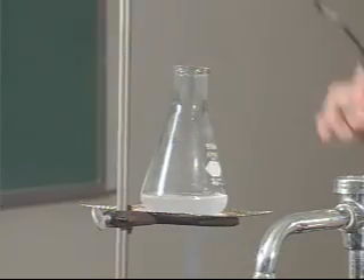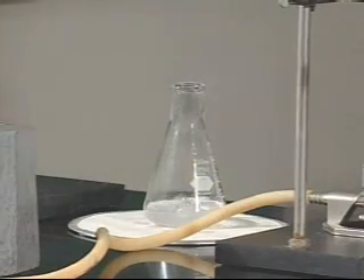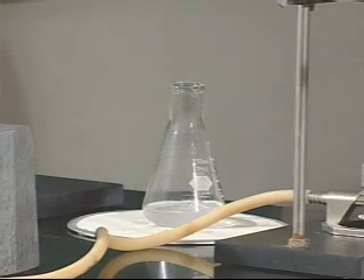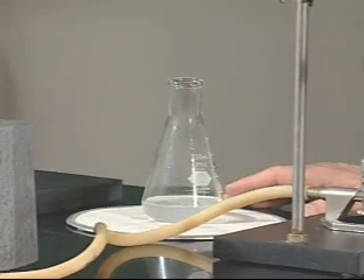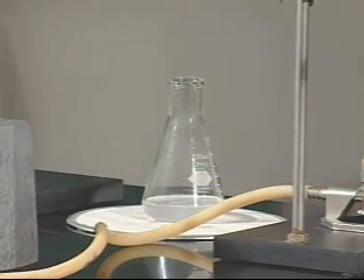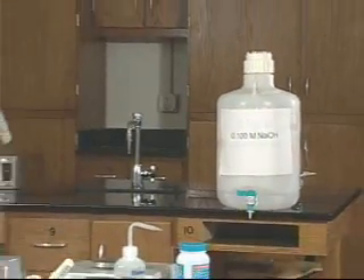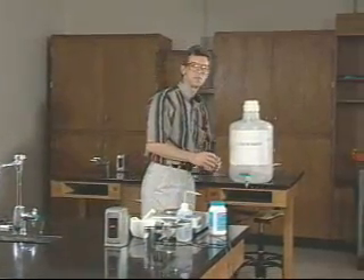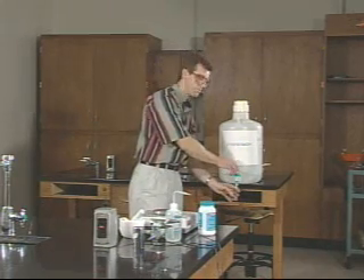Our solution has been boiling about a minute now, so it's time to take it off and let it cool. We'll place it over on the cooling pad and turn off the gas until the next sample comes through. The solution needs to cool, but not necessarily completely to room temperature — as long as it's easily handled by hand, that's cool enough. While our solution is cooling, we can prepare ourselves for the titration. First thing is to get some sodium hydroxide solution from the back of the lab. Note the particular concentration — you probably need to write that down.